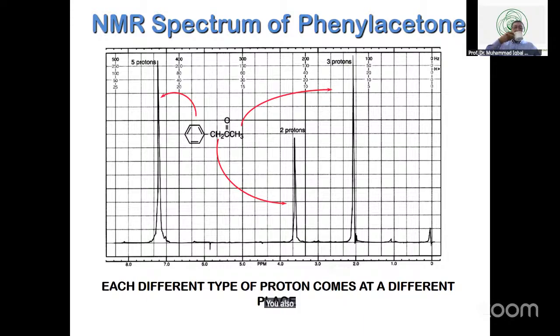You also get one more piece of information, and that is the splitting. In this case, of course, there is no splitting. I expect the splitting to take place here, but it's not. It is actually a low resolution NMR spectrum, to be honest, and therefore I expect that 1, 2, 3 different types of protons appear in it, but continuous wave was not a very ideal technique to see resolution in a higher way.